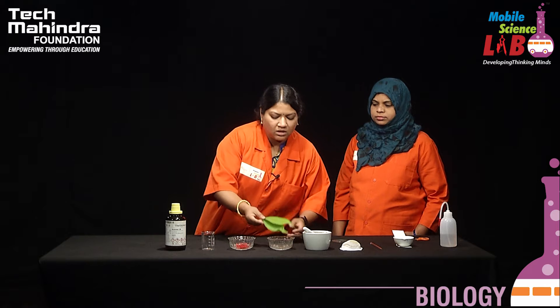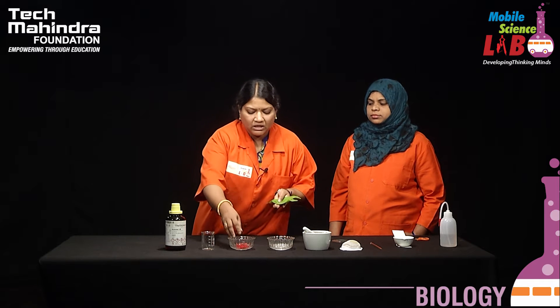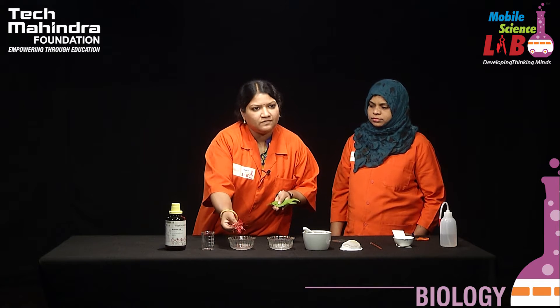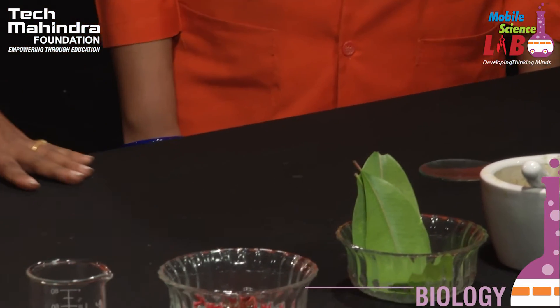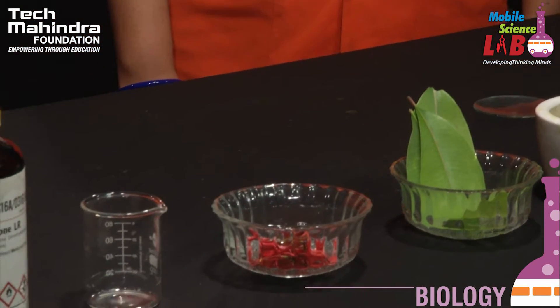Today the sample that we are going to extract is chlorophyll from leaf and the color pigments that are present in the flowers. For this experiment we need a few apparatus and chemicals which my friend will explain.